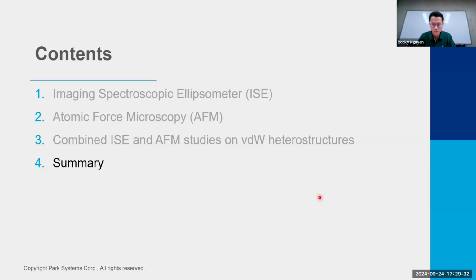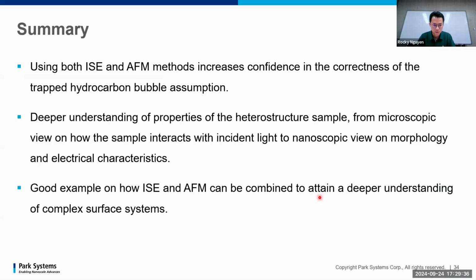So now let me summarize my talk with a few remarks. Using both combined SE and AFM methods increases the confidence in the correctness of the trapped hydrocarbon bubble assumption.